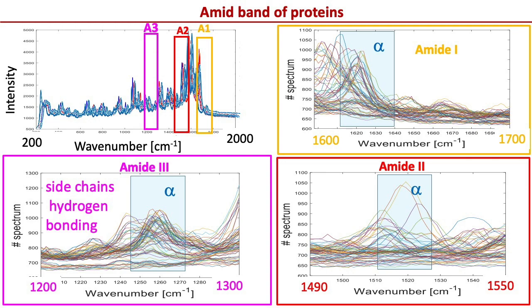Nevertheless, the fluctuations are considerable and symptomatic of the conformation changes. We observe identical Raman shift here. It confirms the composition of the alpha helix percentages. Nevertheless, the amide 1 remains the most interesting spectral window because it provides more information.